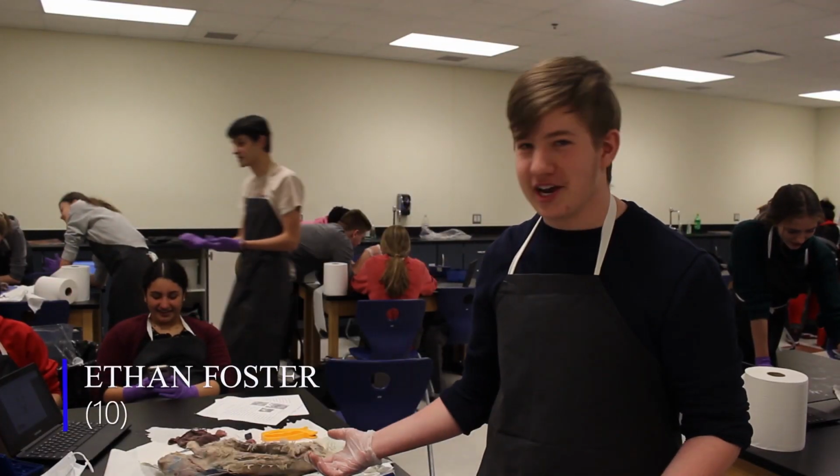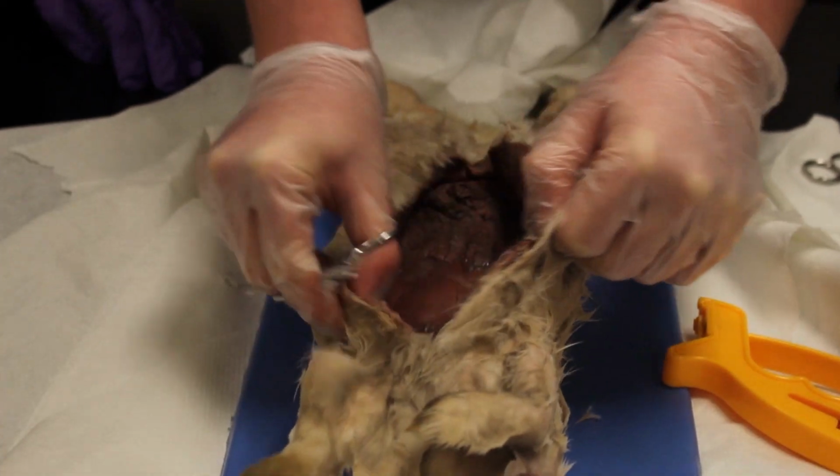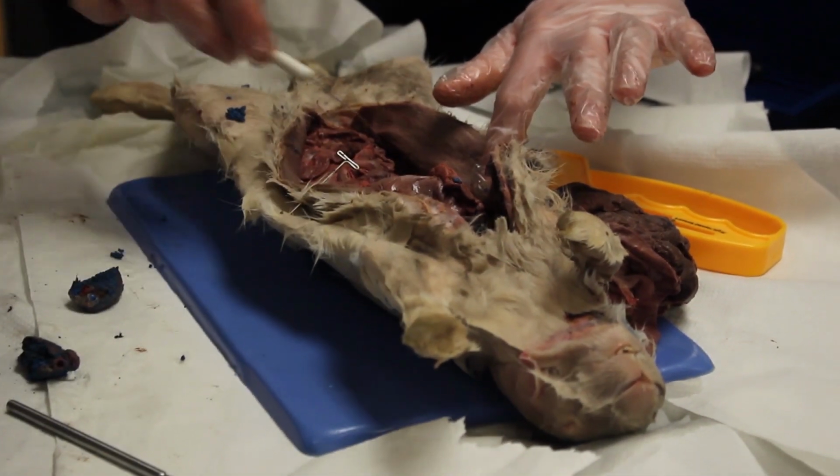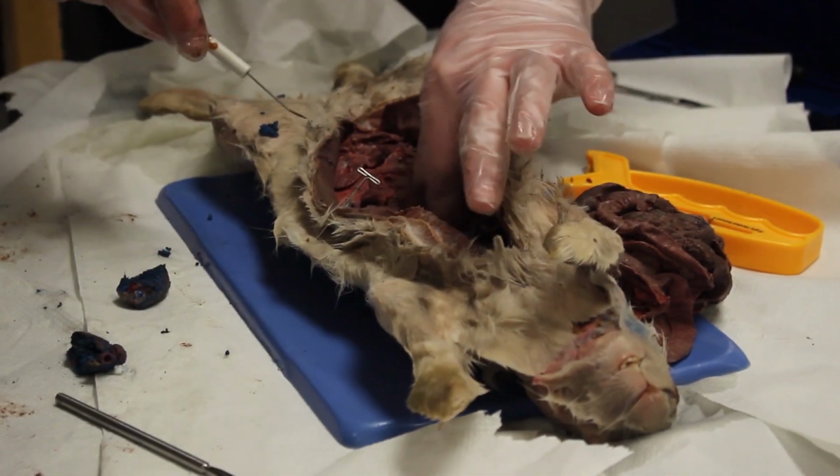We are dissecting the jackrabbit, and it's pretty big. It's pretty fun. It's like a treasure hunt, kind of, but more gross.